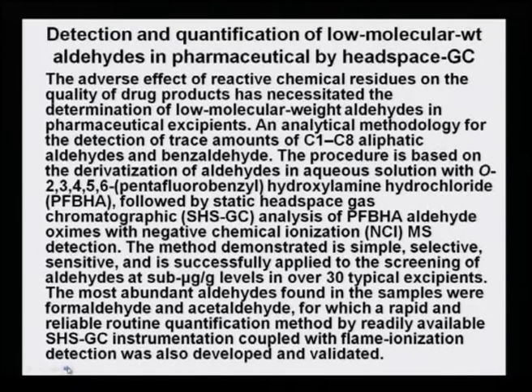The procedure is based on the derivatization of aldehydes in an aqueous solution with 2,3,4,5,6 pentafluorobenzyl hydroxylamine hydrochloride, that is PFBHA, followed by a static headspace gas chromatographic SHS GC analysis of the PFBHA aldehyde oximes with negative chemical ionization mass detection.